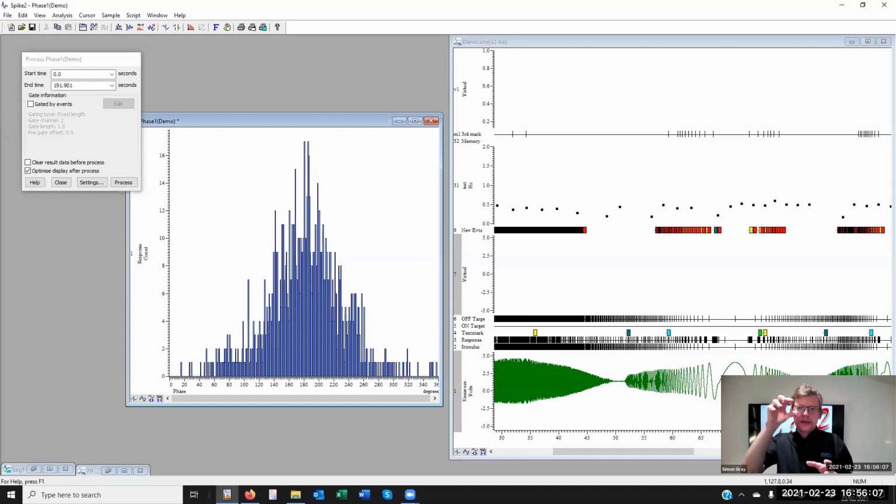And then we've binned the corresponding events into the correct phase within that 360 degrees. So you can imagine now a gate walking, and we have a cycle. The cycle changes in duration, and we would need to treat those cycles as 360 degrees now. Okay, so that's how a phase histogram works.